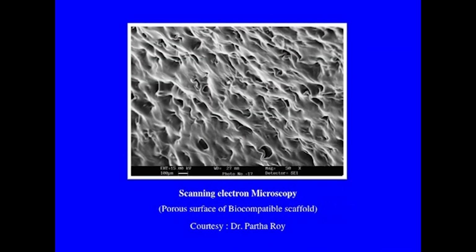This is a scanning electron microscope picture of a porous surface of a biocompatible scaffold, and all the pictures have been provided by Dr. Partha Roy. They have been taken in his lab. So, many thanks to him.